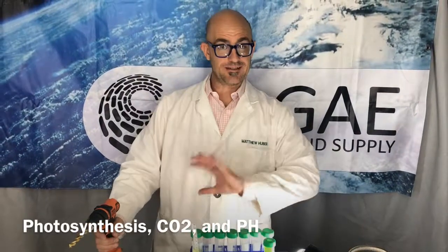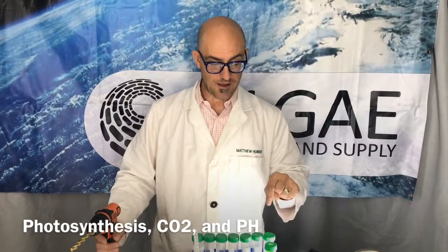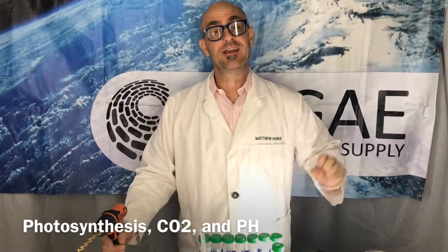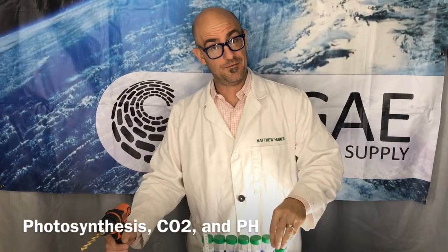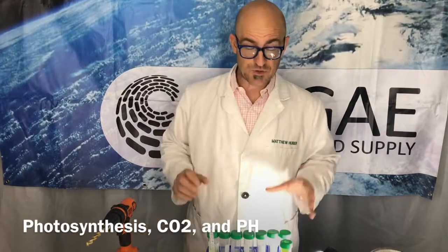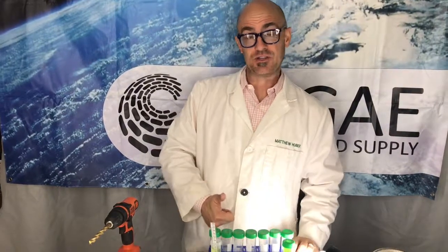Hi, this is Matt from the Dirty Lab Coat and today we're going to be doing a quick little photosynthesis experiment where we're going to be watching a plant of Nannochloropsis consume CO2, and as it consumes CO2 the pH is going to go up.